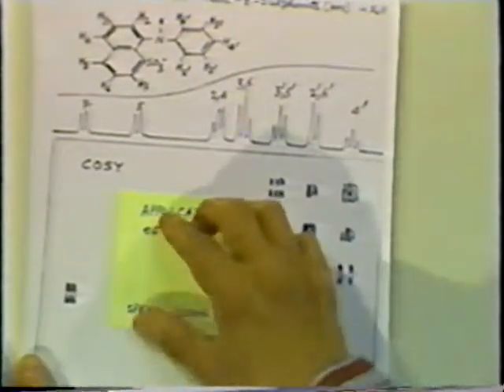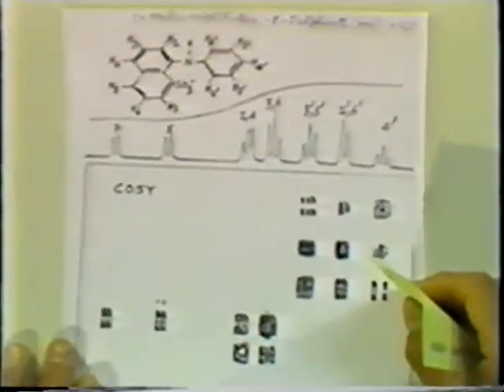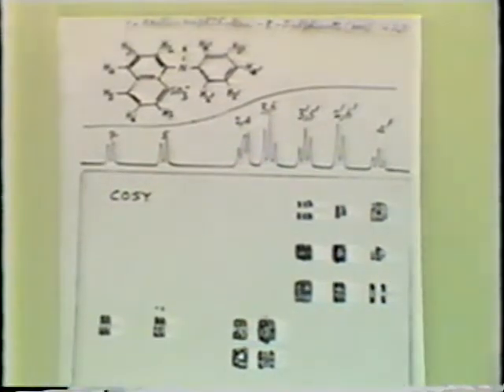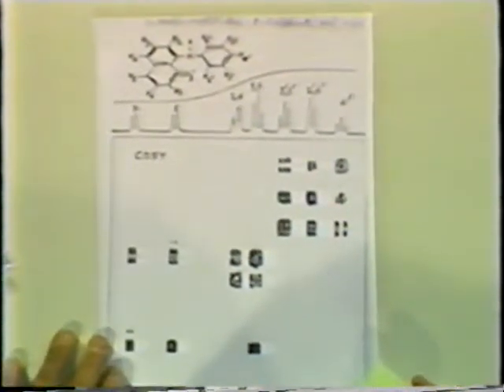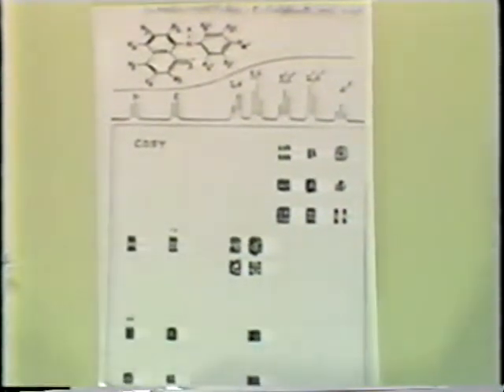We are now going to talk about the applications of COSY. The result looks very illustrative. Actually, it's very pictorial. Two-dimensional NMR spectroscopy is extremely pictorial. And here is the COSY spectrum.